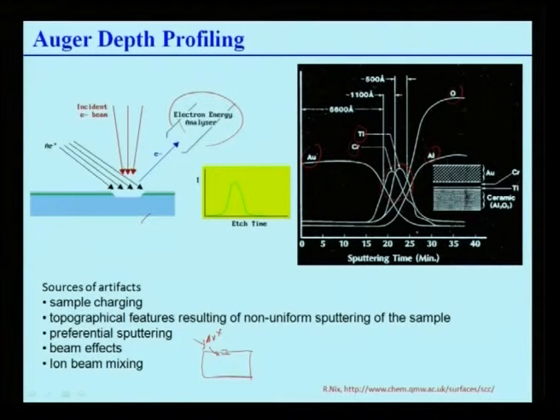So what does it mean? This is a very important aspect which you must know. This is actually required in material science. That means that although this is a very sensitive technique, it can be used to do such fine scale depth profiling by using argon ion sputtering.